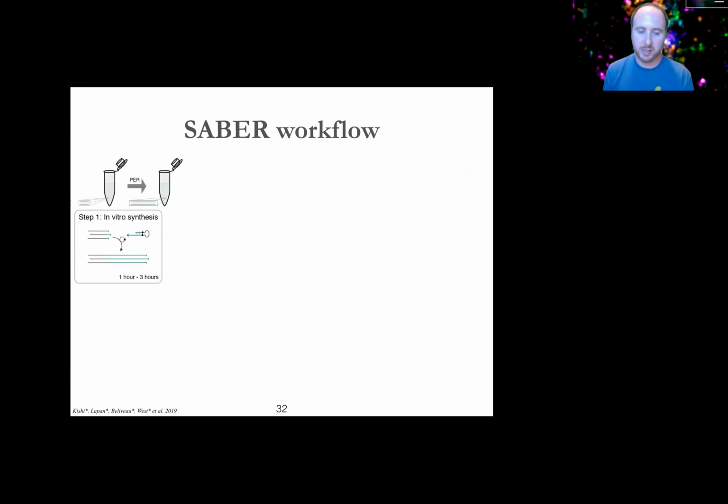So the way that SABER works, I do think makes it a little bit distinct from the RCA and HCR approaches, is that we first do the synthesis in vitro. And this is really key because it lets you QC what you're doing before you go on to do anything more complicated or expensive. I think for me, I love those techniques. I think they're tremendously clever and really powerful, but some of my frustrations from using them over the years is that if I get an experiment where I don't see my desired result from it, where I need a reaction to be happening in situ, be it an assembly reaction for HCR or an enzymatic reaction for RCA, it's just hard to know what to troubleshoot or what went wrong.